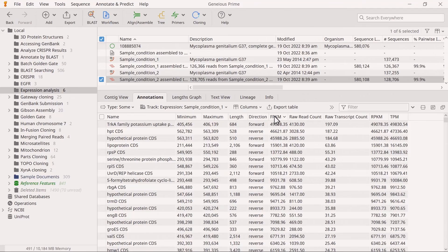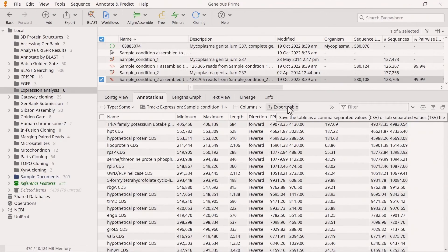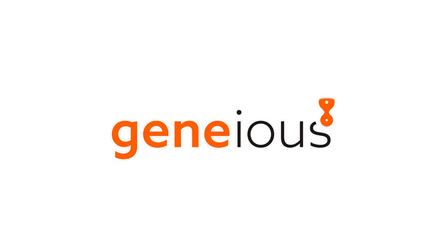Finally, select Export Table to export this table as a CSV file. And that's how you calculate expression levels in Geneious Prime. To learn more, visit Geneious.com.